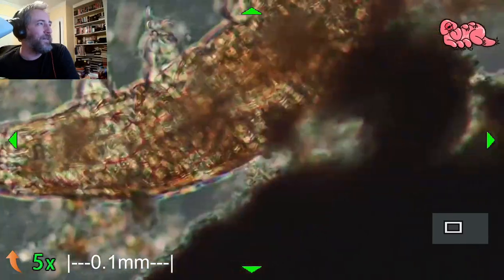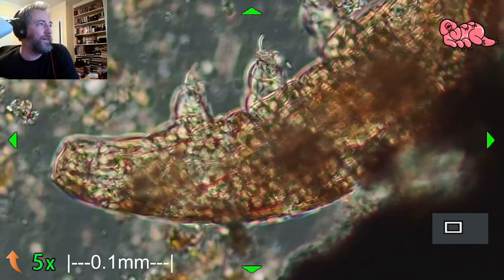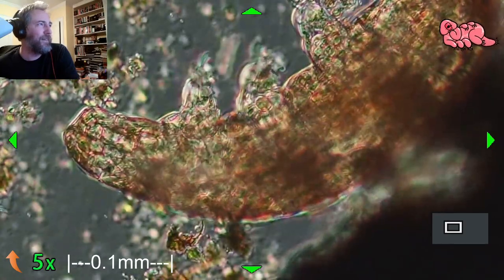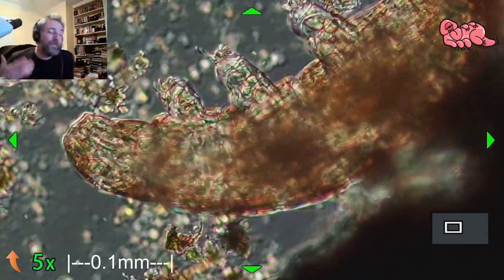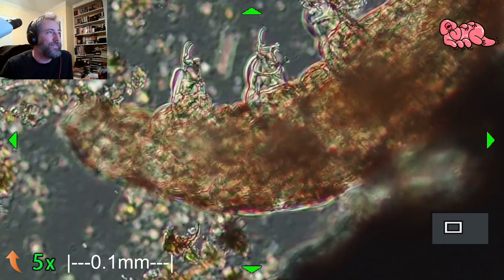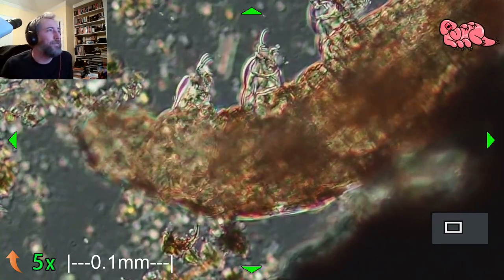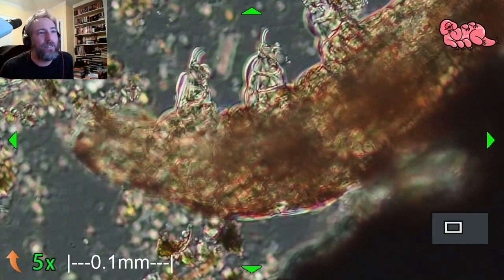They're only able to do that when they're hibernating, when they're in this cryptobiotic state where they're not quite living. They're not dead, but they're not quite living either. They're basically completely little dehydrated balls, basically. So yeah, don't kill them.